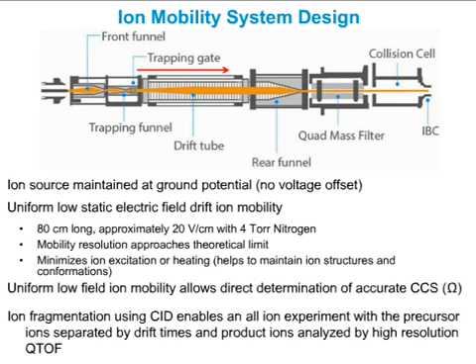Okay, on the next slide, I'm going to go into a little more detail about the mobility part of the system. You can see the figure here now just focuses on the mobility section before the mass spectrometer. I'll go from left to right and walk through the system and talk about the major points. On the far left would be the ion source. I don't actually show the probe, but in this case it could be electrospray or APCI or nanospray.